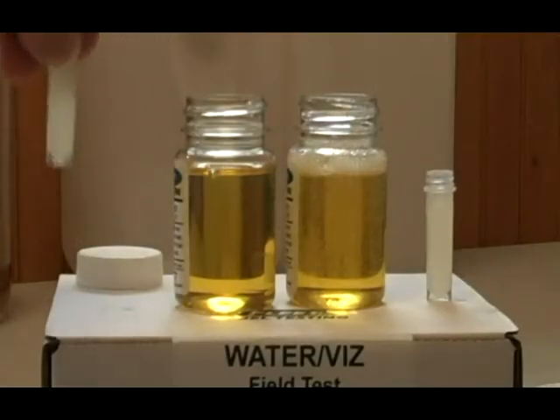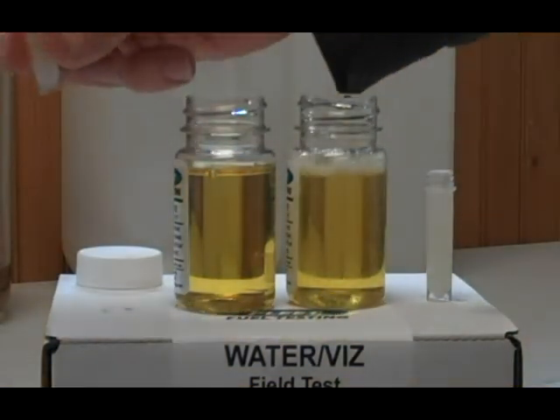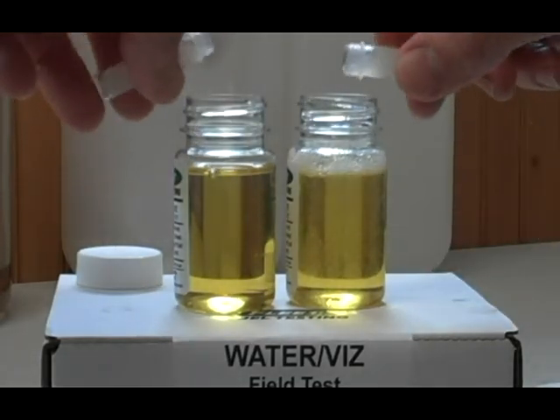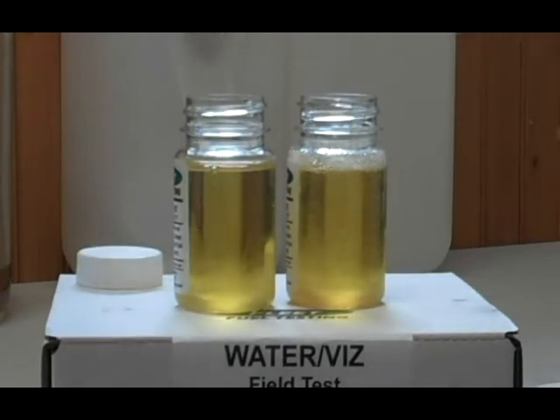We're going to add our water indicating solutions. Make sure these are mixed up well — give them a little flick and a mix when you get them to make sure the solution is mixed up. We're going to add those directly to our two samples, and then we're going to cap and shake.